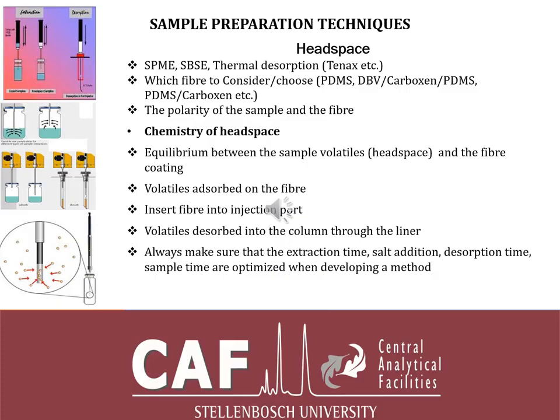The most used desorption time is 1 minute or 2 minutes. But if you don't have what they call a fiber conditioning station, if you're not doing automated SPME, one might leave the fiber for longer, maybe 10-20 minutes, in the injection port, because after a minute or two the compounds are already in the column, and all that's left for the remainder of the time is for the fiber to be cleaned in the injection port.